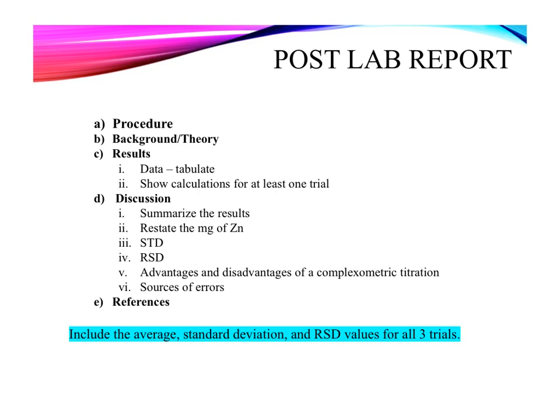Make sure that your lab report includes the average, the standard deviation, and the RSD values for all 3 trials, while making sure that you only have calculations for one trial. You do not need to have calculations for all 3 trials. Your lab report is 30 points.